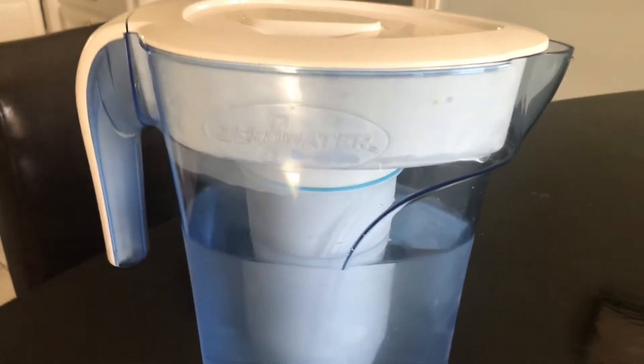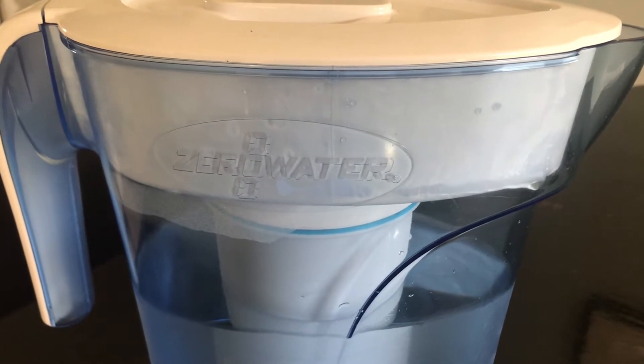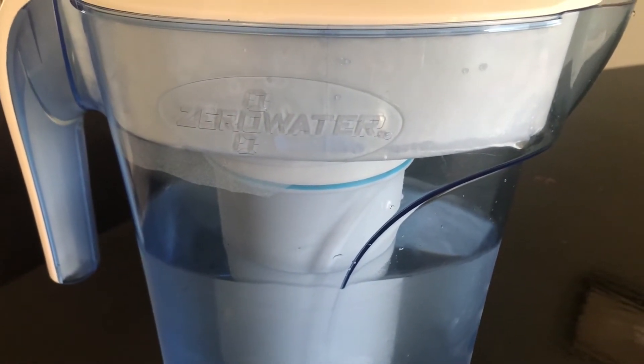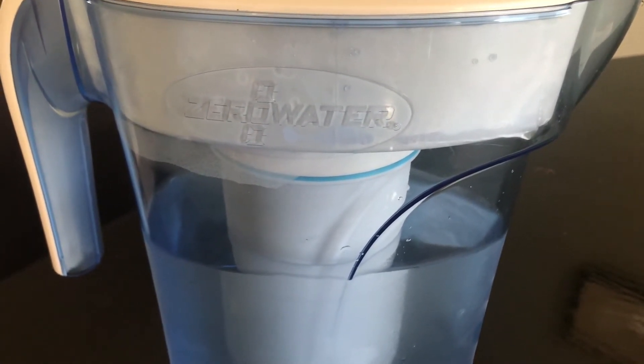We bought this Zero Water filter to try to get some better water to drink, and we would like to know what is the pH of this Zero Water.